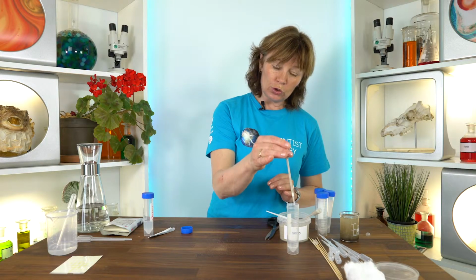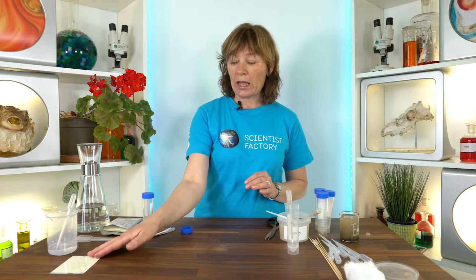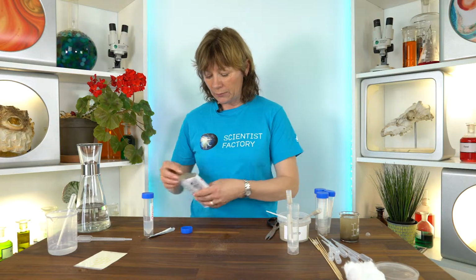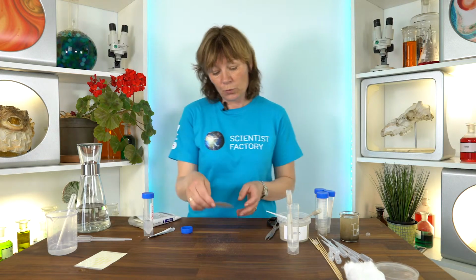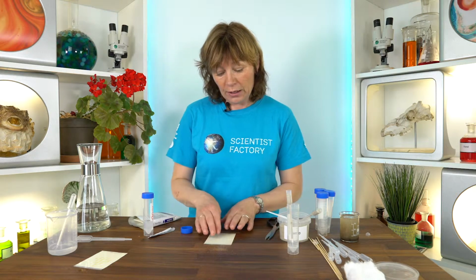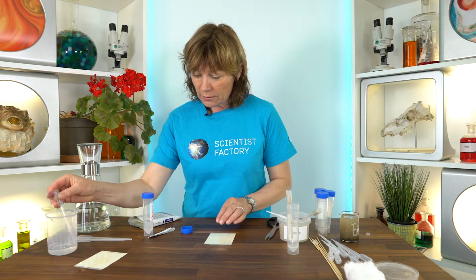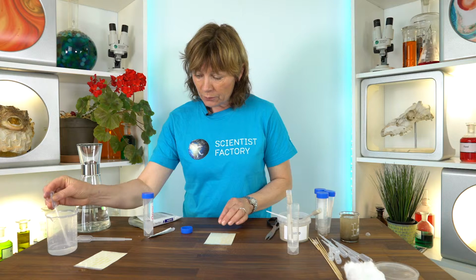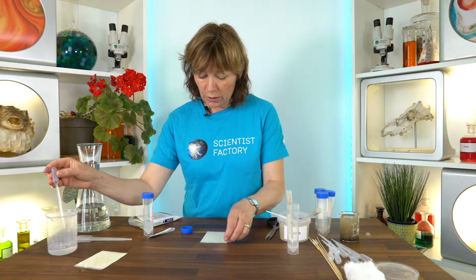It's actually a very good idea when you make the first column, you do it together step by step. And you also help them make the first Petri film together. For example, you can say that now we're going to test what is the bacteria in clean drinking water, and you just add 1 milliliter.